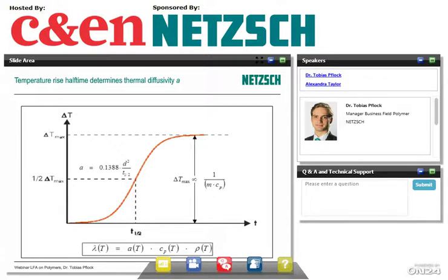Because we're not quite there, what we want to get is thermal conductivity. Thermal conductivity is always shown with the letter lambda. You see here at the bottom, this is the formula that we get. And for that, we measure thermal diffusivity alpha, we measure Cp, specific heat, and we need the density as well.